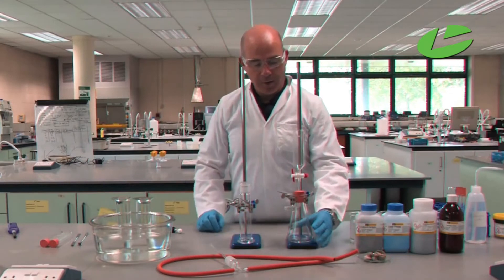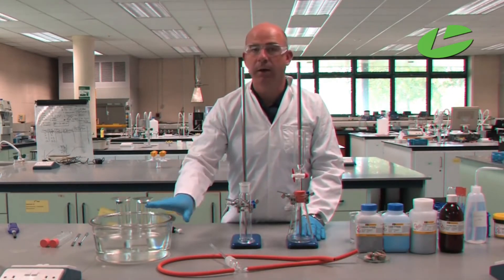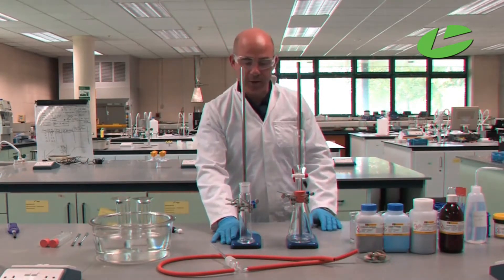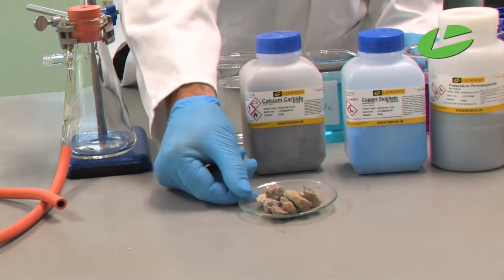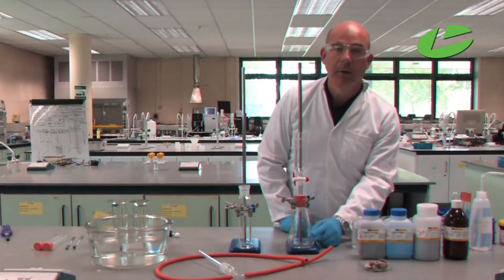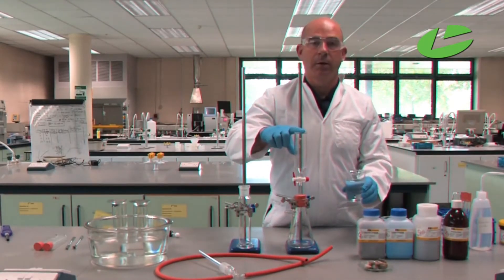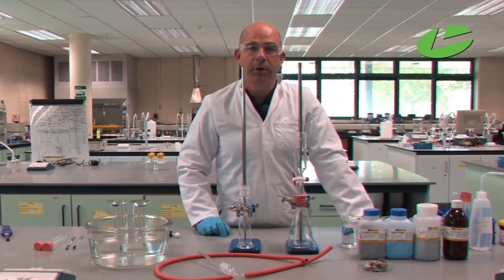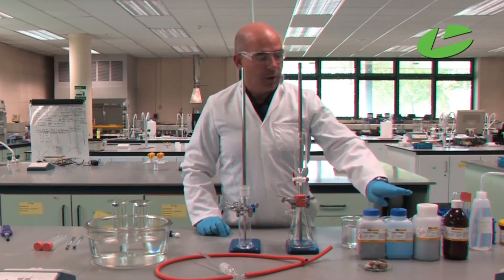To prepare ethyne gas, you need a Buchner flask with a dropping funnel and a threshold head into a collecting jar. The chemicals we're using are calcium carbide, which goes into the Buchner flask, and deionized water in the dropping funnel. When preparing ethyne gas, there are impurities, so we use acidified copper sulfate to remove them.